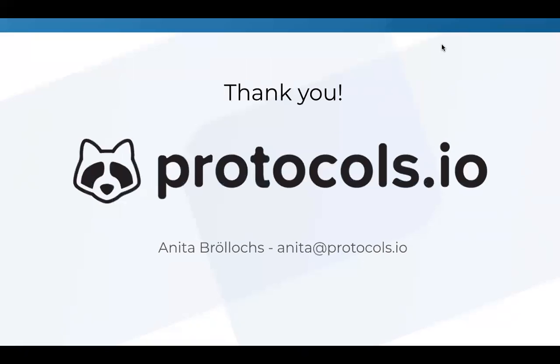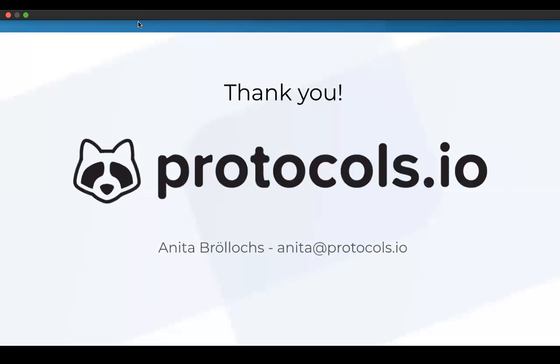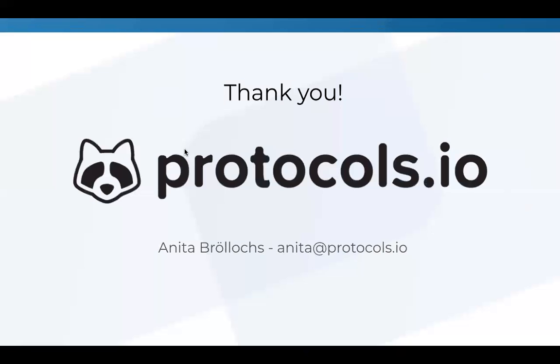Any more questions? And this is Lenny. This is not a question. Thank you, Anita. Not a question, just a quick small item that I wanted to add because it often comes up. People worry, what if something happens, not in the long term, even about Protocols.io as a company, but what if there is a denial of service attack? What if Amazon goes down? What if I cannot access my protocols and my files?